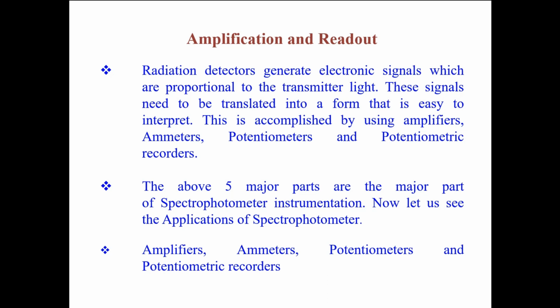And the readout devices also include printers, because you can straight away link the system and take the printout. So we may get the graphs, right? Those graphs can also appear in modern spectrophotometric instruments, and those graphs can also be drawn with the readout device. We can see that on the screen, but we cannot download it, but you can get it printed so that you can have the hard copy. So that is also a readout device.